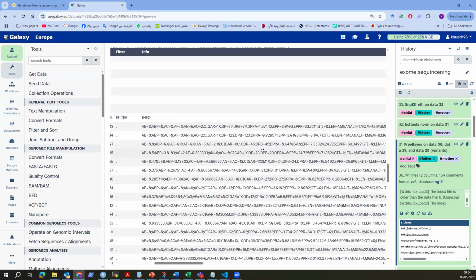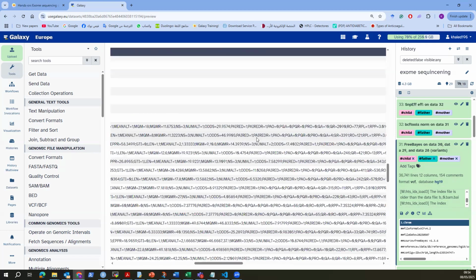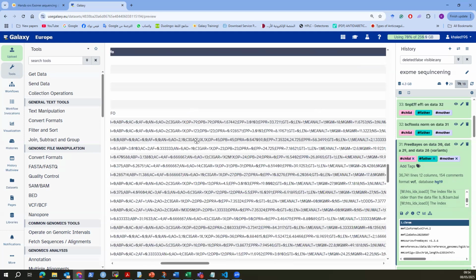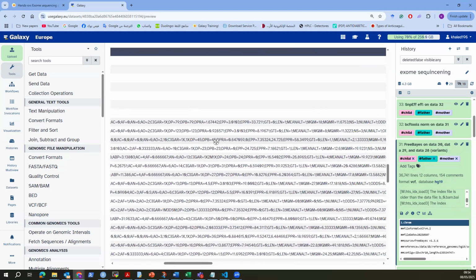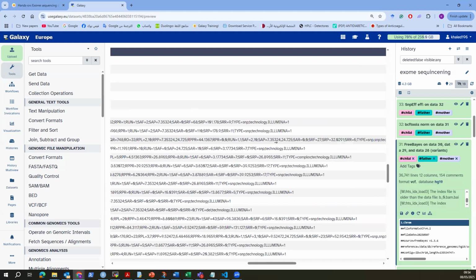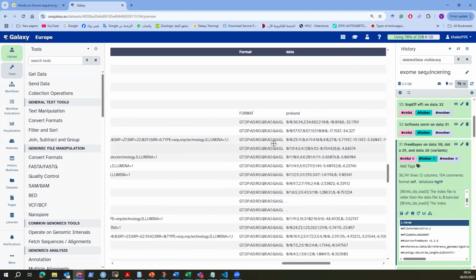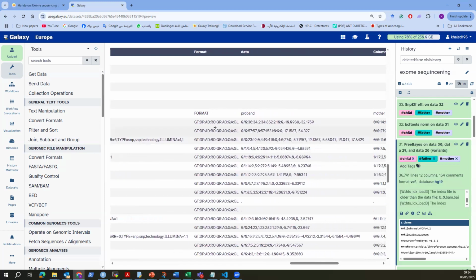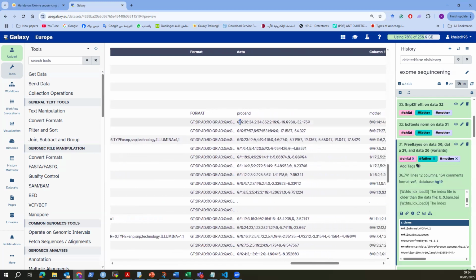And they give you other information about the variants, such as where they are located, the type of the variants, and annotation data, so they can be expanded later on. And then you get the format. So you have the genotype, which, if it's 0/0, means there are no changes compared to the reference, while if it's 0/1, there is a difference, it is heterozygous.